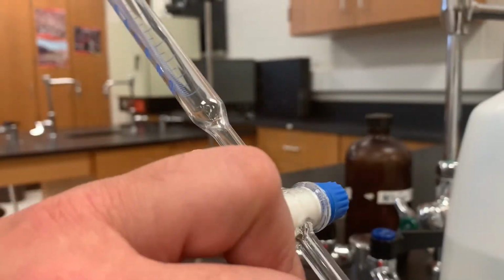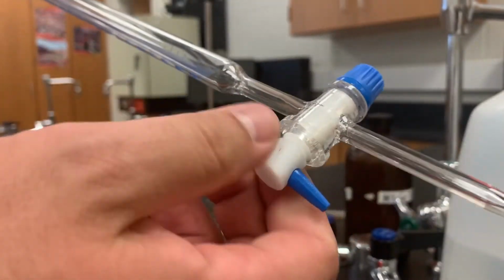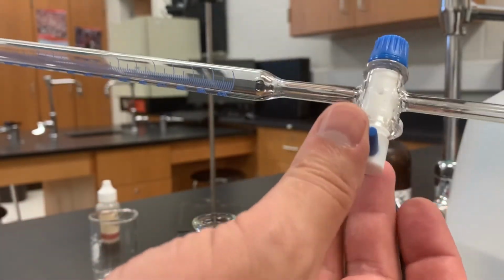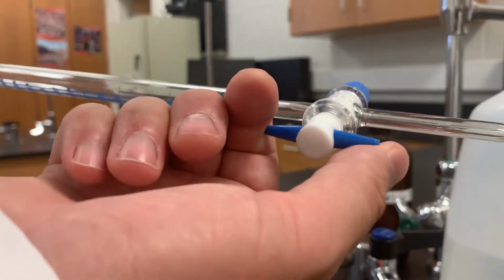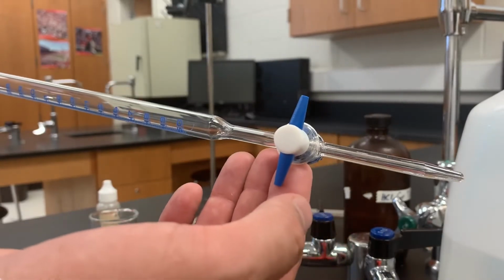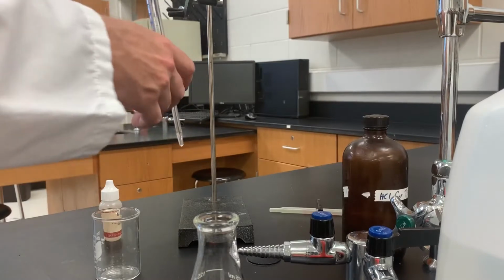It also has this little valve assembly, which is called a stopcock. It is a Teflon coated plug that has a little hole in it. And when the handle is in line with the column and the tip, then the liquid can flow through. And when you turn it perpendicular like that, the liquid stops flowing. And then this part down here is called the tip.